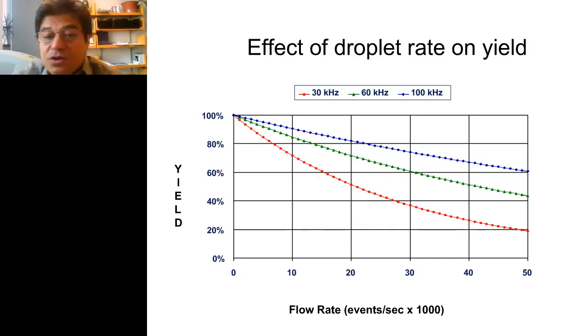And a cell sorter can note that, and the preference, of course, is for purity. If multiple cells are coming through at the same time, they are not sorted. It's called aborted. They're looked at, but they're not sorted. So this is where the cell loss occurs. And as you continue to try to go faster and faster with the flow rate, you start to get less and less material. So it's diminishing returns. You're not going to be able to sort very fast.